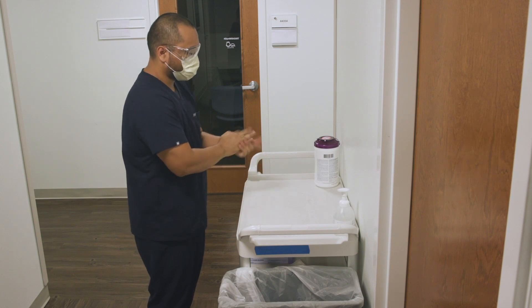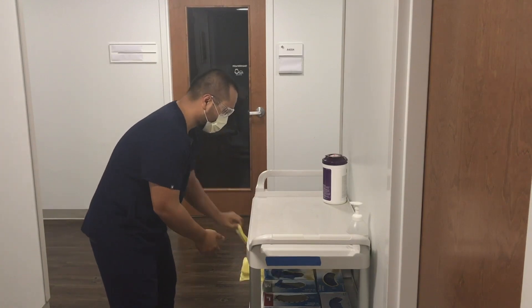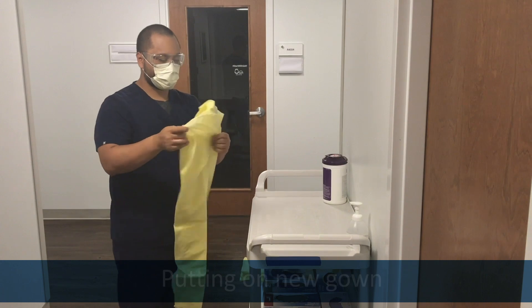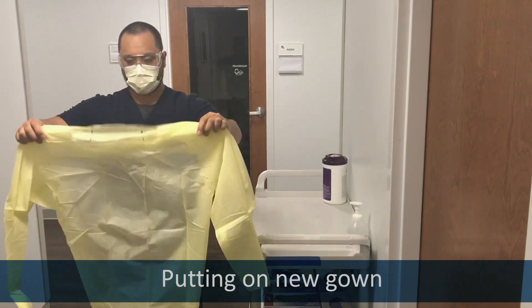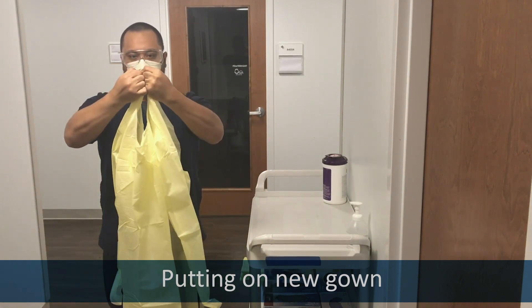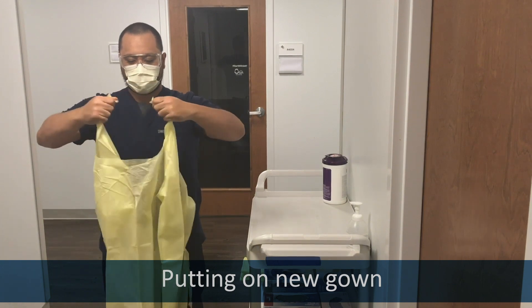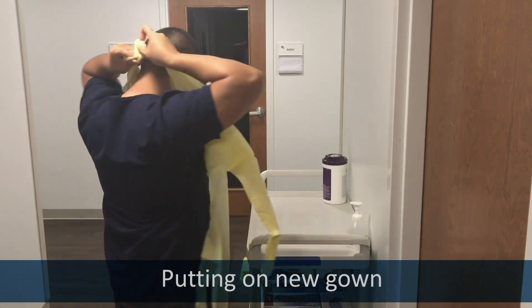Keep your face and eye protection on if they're not visibly soiled. Get a gown. If you have the kind of gown that goes on over the head, do not put it on this way. Carefully tear the neck at the center. It helps if you grip the gown so that your hands protect the seams. Tear it. Tie the neck in a double knot.